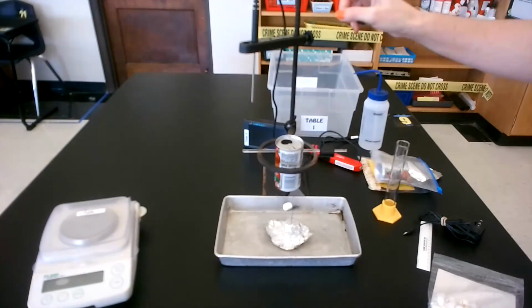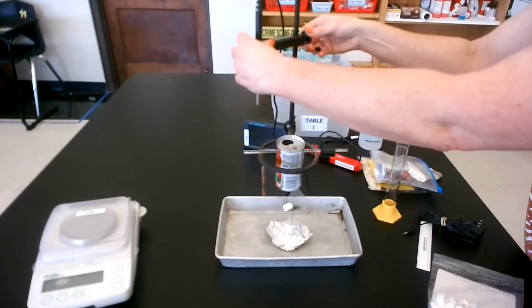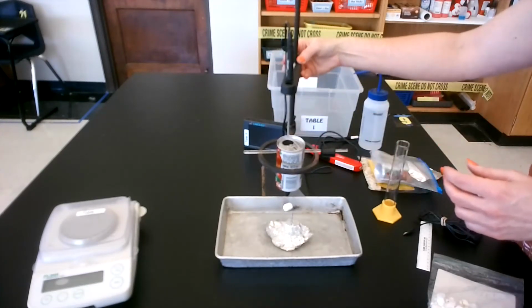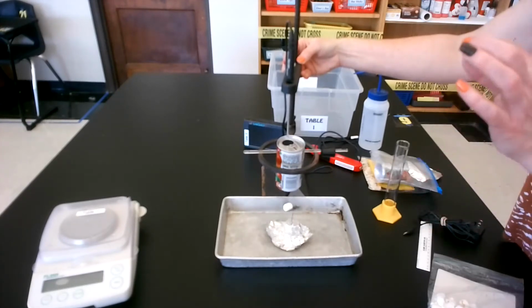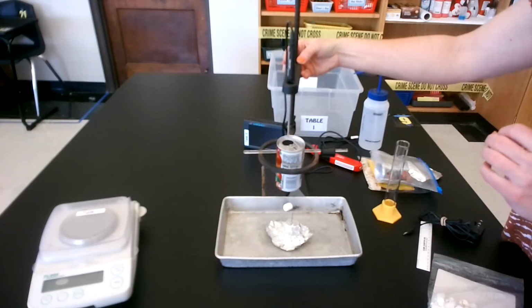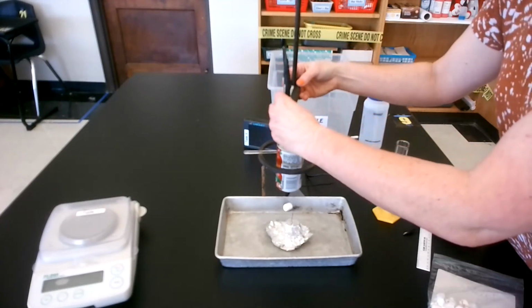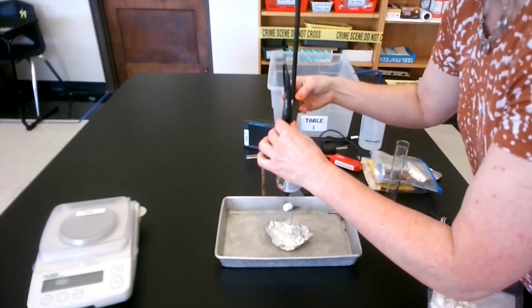Then I need to move my thermometer down into my can. Now this is a little tricky. I don't want the tip of the thermometer touching the bottom of the can, the sides of the can, or the stirring rod. I want it suspended just below the surface so I can get the temperature of the water as the heat from the food is heating up the water. So you need to look down into the can, and one person can do this and then someone can check.